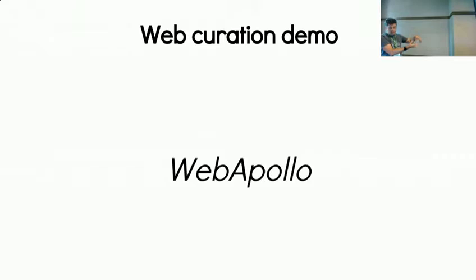So that's running there. And it's a great question, because the way we get it back out again is, refresh this here. Actually, I don't even need to do that. What you do next is you can obviously just export it from the tool directly, but that kind of defeats the purpose. You can click on retrieve data, and this should bring up the proper data there. It should grab anything that you have as a GFF3 and a FASTA.